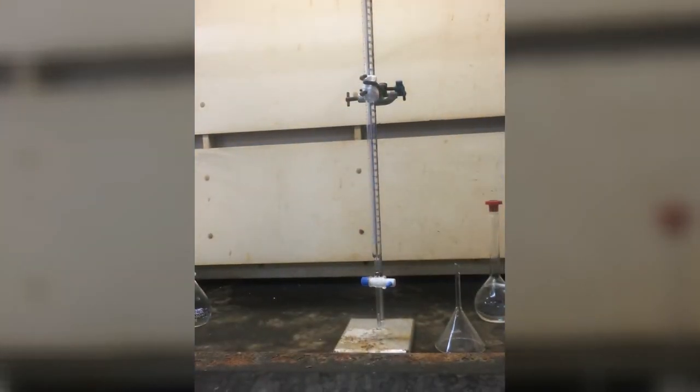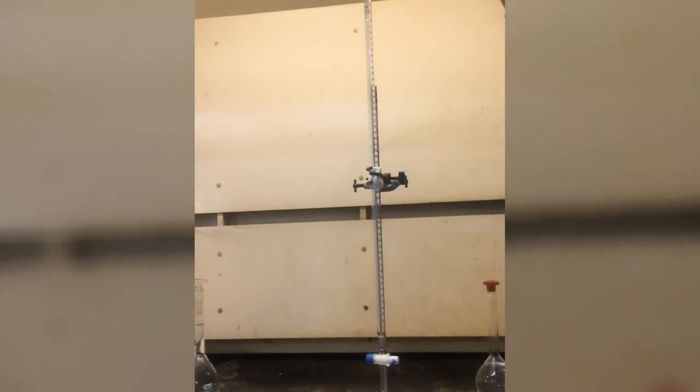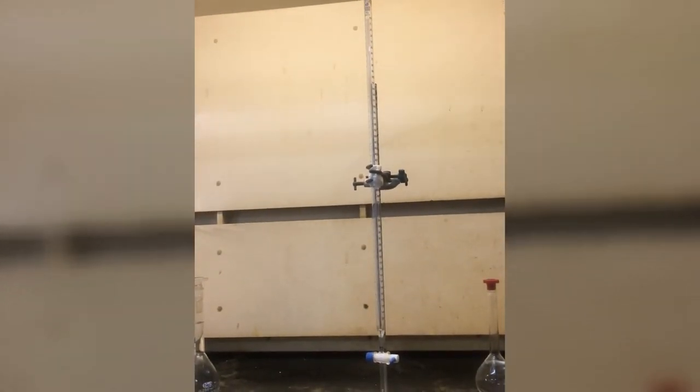So first, we are conditioning the burette with a dilute HCl solution. Conditioning essentially reduces the probability of contamination of your solution.